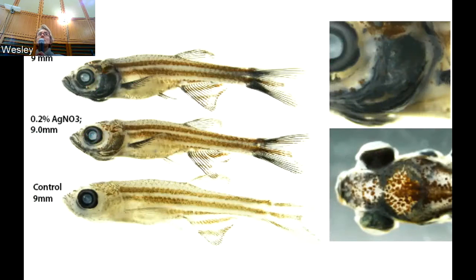So one of the goals that we talked about at the last meeting was trying to figure out a way to integrate the micro-CT data and the confocal data into a single model. And there are a lot of challenges inherent in that approach. I mean, one is that, of course, the data is generated in two completely different ways and has some different characters.